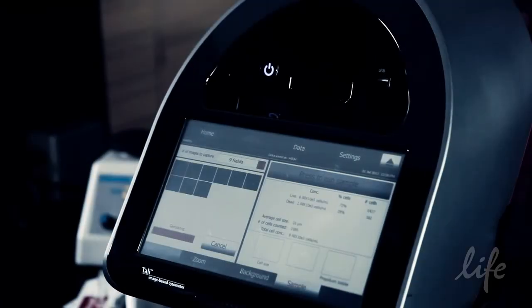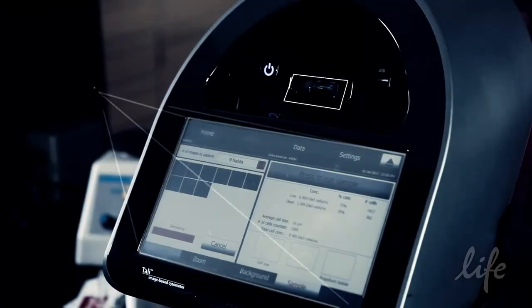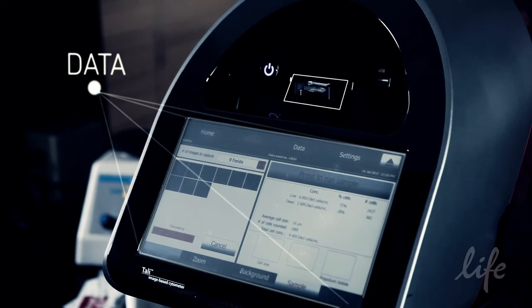After analysis, the Tally automatically ejects the slide and provides the data from the analysis of the captured images in the Sample tab.